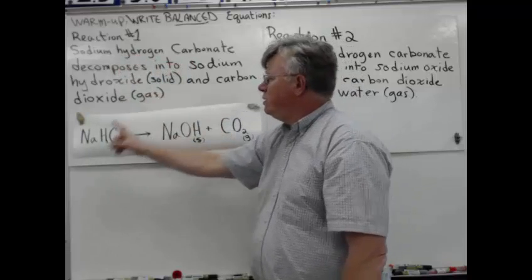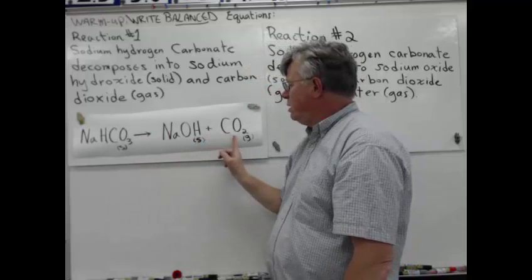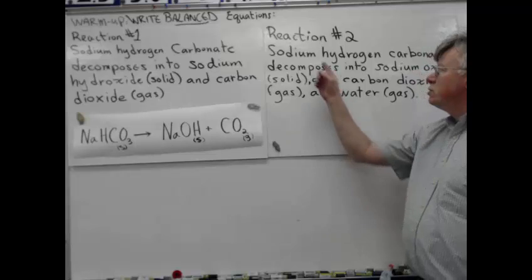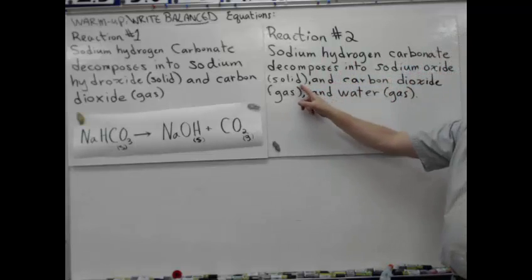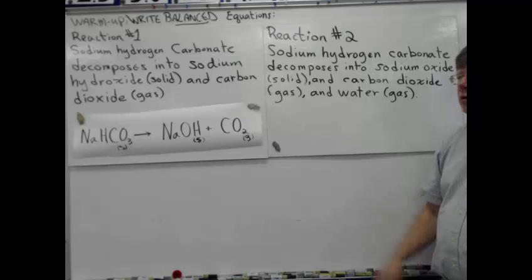Sodium hydrogen carbonate decomposes into solid sodium hydroxide and carbon dioxide gas. So that's the first one. The second reaction is sodium hydrogen carbonate decomposes into sodium oxide, solid, and carbon dioxide gas and water gas. Take a second and do that on your paper.